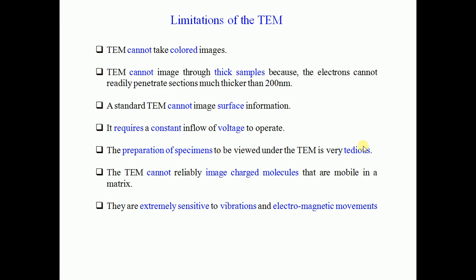Constant input voltage is necessary for TEM. This is one of the disadvantages. Preparation of the sample is tedious in TEM. TEM cannot image charged molecules that are mobile in the matrix, and it is extremely sensitive to vibrations and electromagnetic movements.